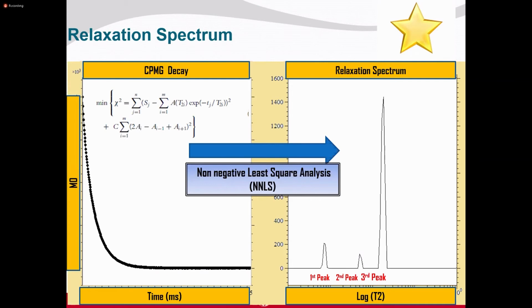On the other hand, if you have, let's say, acetic acid or one type of vinegar, in the vinegar you may obtain just one peak, one relaxation time, because T2 might not be sufficient to tell you what other components exist in the vinegar. However, if you have distinct relaxation times, this is the kind of behavior that we would see.